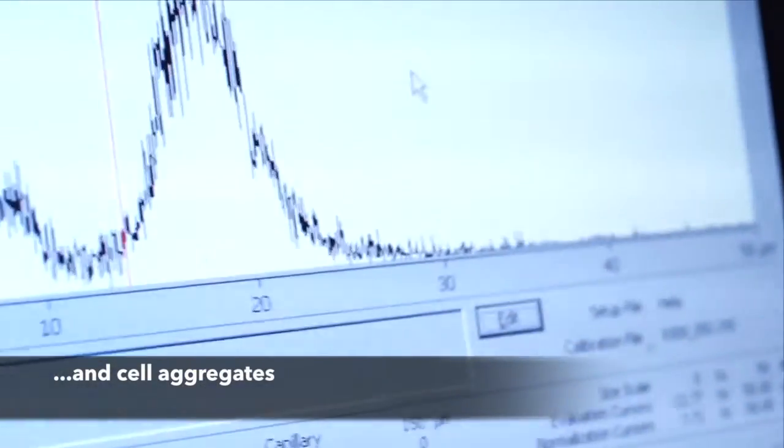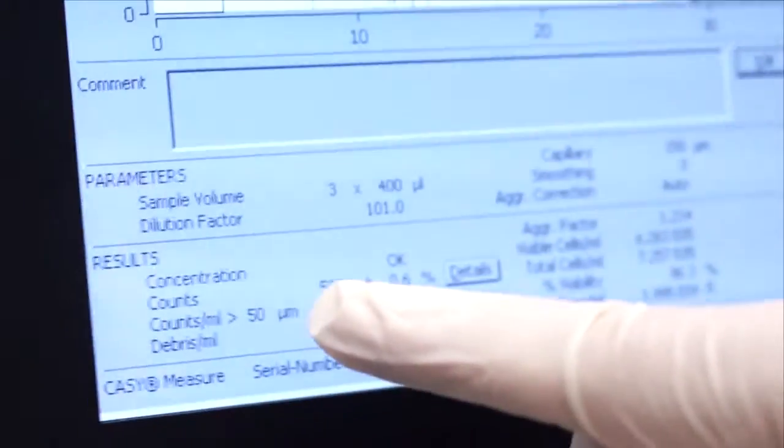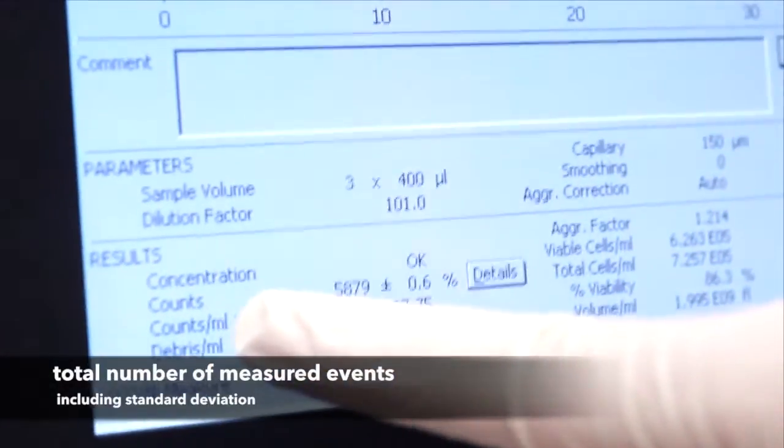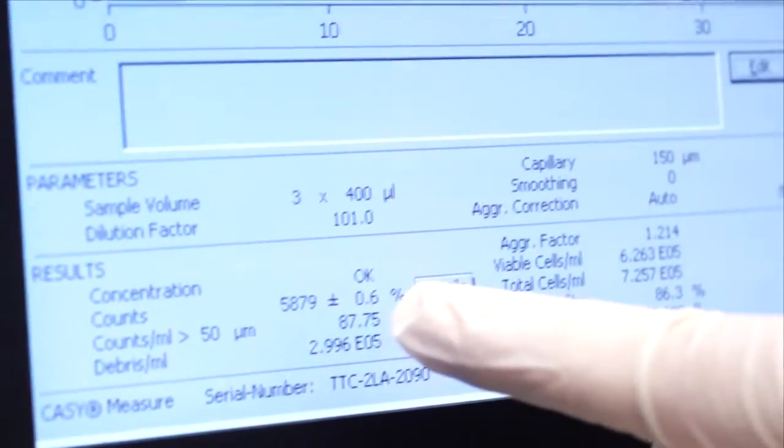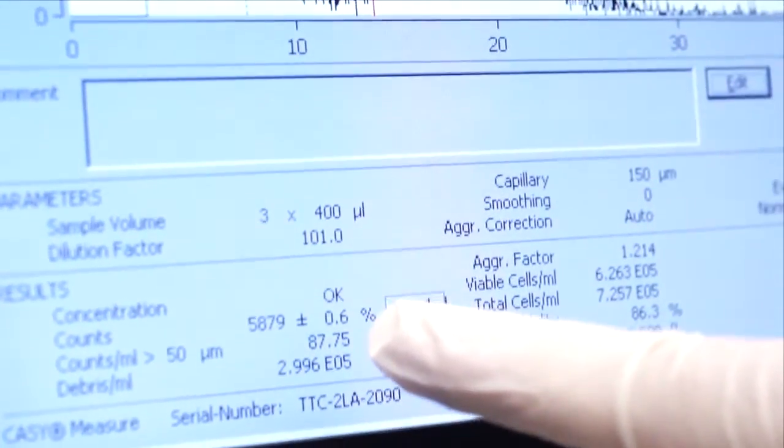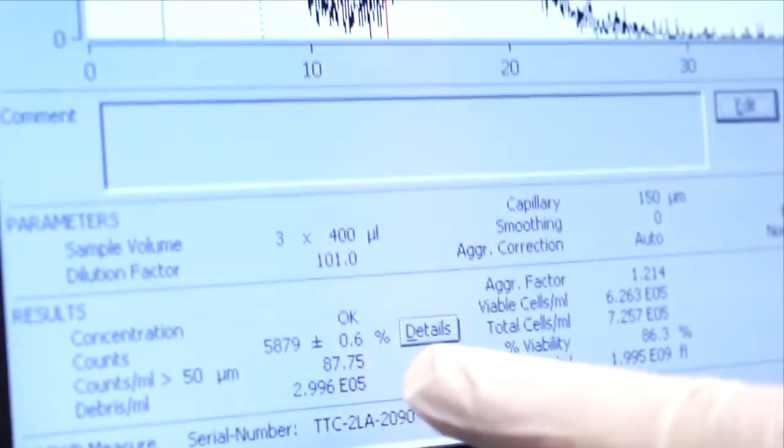As numerical results, we first get the total number of measured events. In this case, 5879, with a standard deviation which as you can see here is very good, plus minus 0.6%.